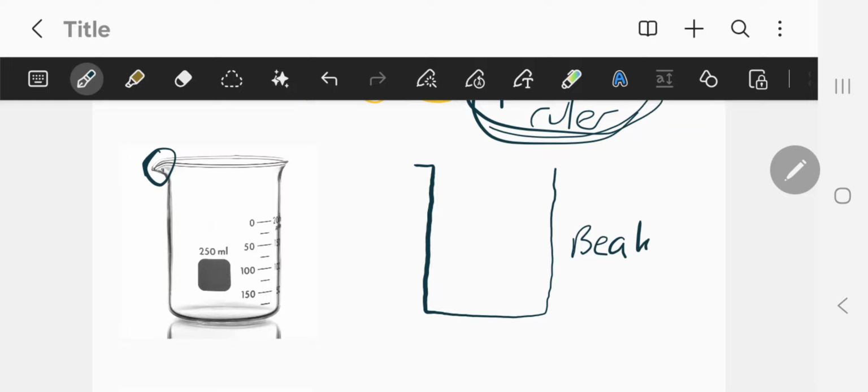This is called a beaker. It's quite simple. Okay, but just using lines here. I'm not going to be showing any of this stuff here or the curve there. Nice and simple. And that's the spout there, okay, that I drew there. That's your beaker. So you can stop and pause anytime, just so you can draw it, but I'll move on now.